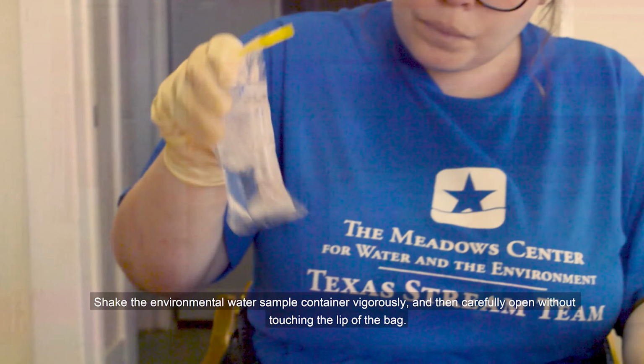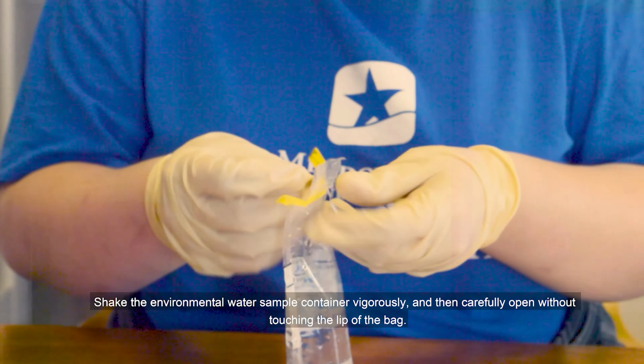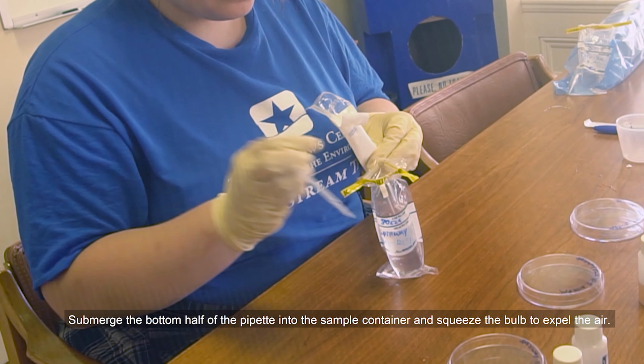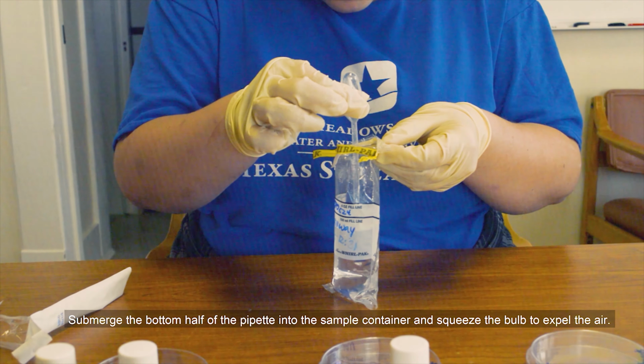Shake the environmental water sample containers vigorously, and then carefully open without touching the lip of the bag. Unwrap the pipette from the bulb end and avoid contacting the tip from anything except the sample water. Submerge the bottom half of the pipette into the sample container and squeeze the bulb to expel the air.